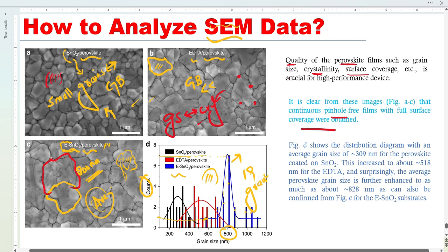There are no pinholes, no holes - all these are good. But now let's see which one is superior. Figure D shows the distribution diagram with average grain size. The average size is basically for the perovskite coated on SnO2 - this one shows basically 309 nanometers. This shows 518 for sample B, and the last one is basically around 822 nanometers average size. This can also be confirmed from Figure C. From Figure C we can clearly see the grain size is very, very clear.